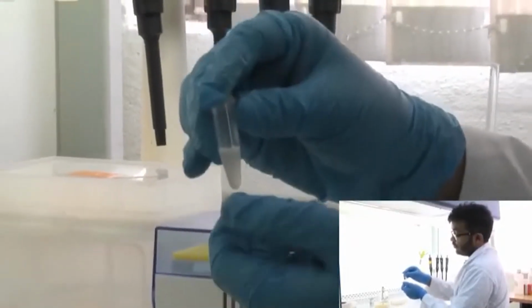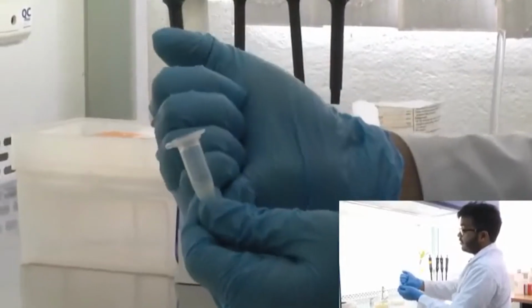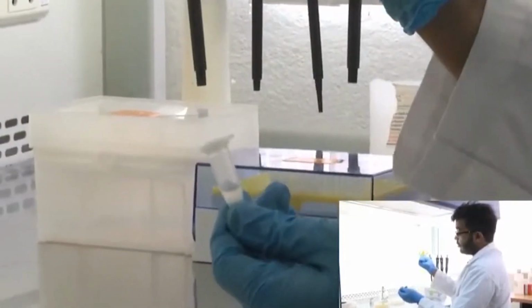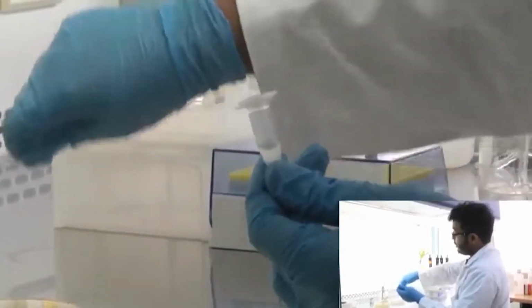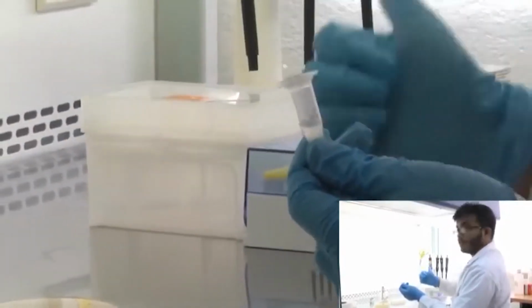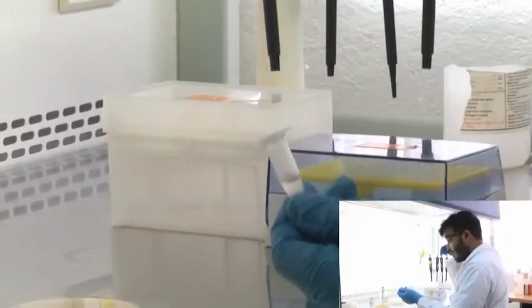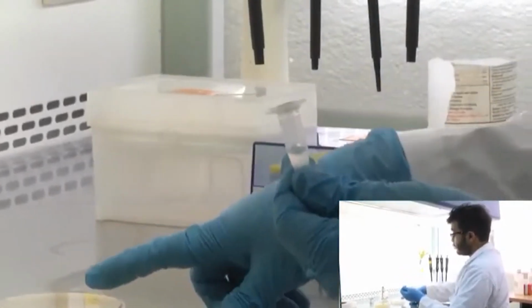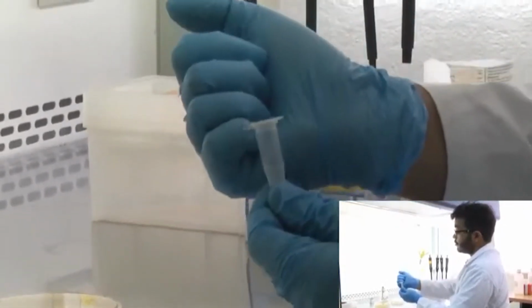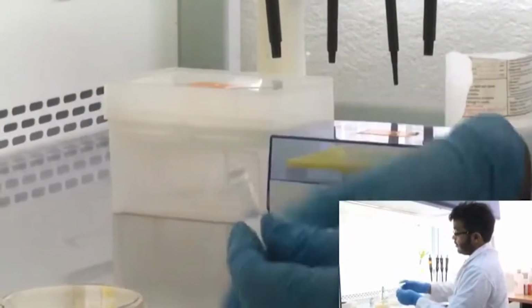So out of this 450 microliter, I have 2 plates. In one of them I am going to take 200 microliter of the culture, put it at the center of the plate, and then spread it across the entire plate using a spreader. I am going to show you how it's done in the next couple of minutes. And in another plate, I am going to take a smaller amount, 10 times less. Since I took 200 microliter for this, I am going to take 20 microliter of culture and spread it on the other plate.